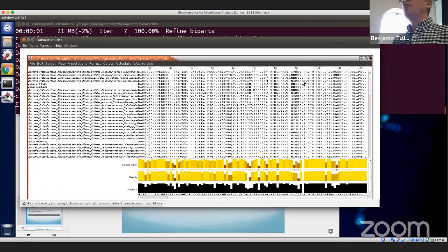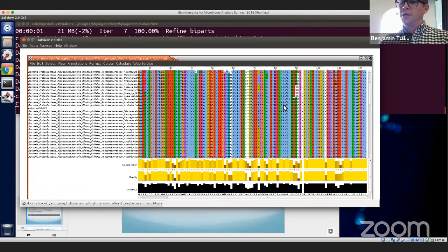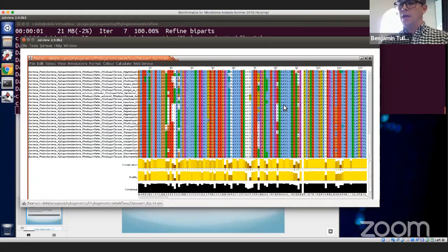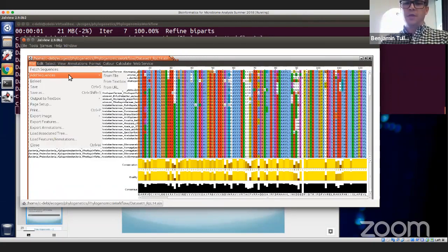So this is really nice. This is an example of things on the very easy side. Let's try this. We can add some colors to make it easier to see, or less easy to see, depending on your preference. The colors of a block all indicate positions with really high similarity to each other. And that's RPL14. So there's only one spot that we can really see and identify, and if we were going to trim this manually, we would trim it there.